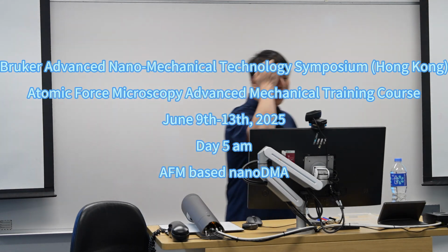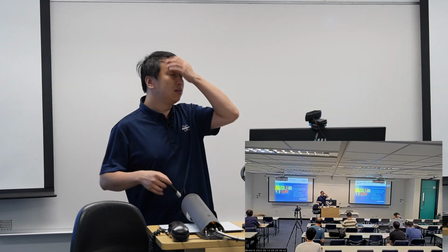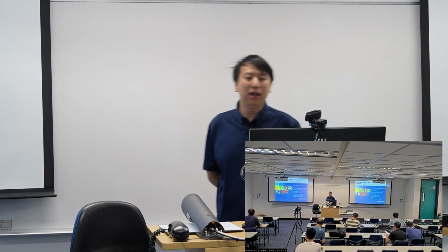Okay, so we will have our last topic this morning, which is the AFM based dynamic mechanical analysis, the so-called AFM DMA. And the DMA is used to measure the viscoelasticities, but in the frequency domain. So this morning, I think we just need about 2 hours or 1.5 to finish the principal part, and then we can go directly to the hands-on session on this technique.